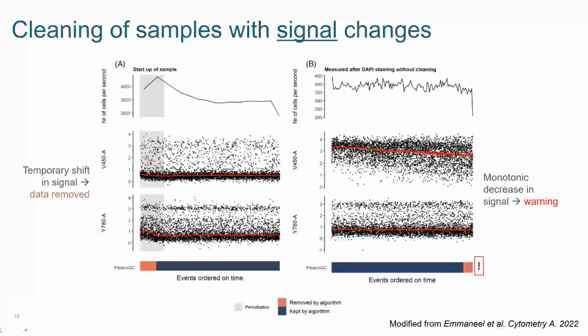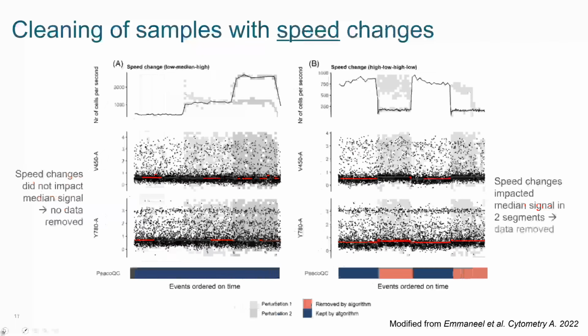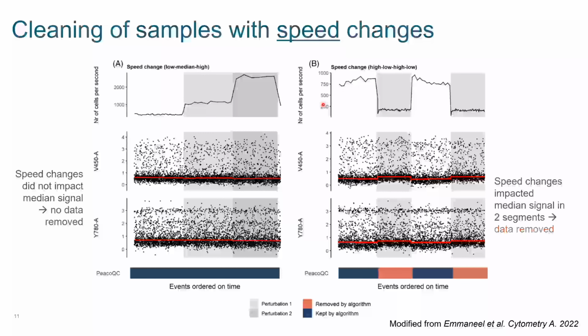I see. So I think it has to do with this plot. I think we're talking about this plot here, for instance. Is that correct, Mickey? I'm not sure if I'm saying your name correctly. I think the question had to do with this panel B. Okay, great. Thank you. So high, low, high, low. Yeah, that's a good question, right? So how do we dictate what's the anomaly?